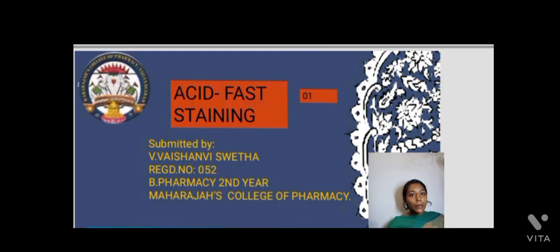Today my seminar topic is acid fast staining. Acid fast staining is a very important topic in microbiology which helps to differentiate acid fast bacteria from non-acid fast bacteria.